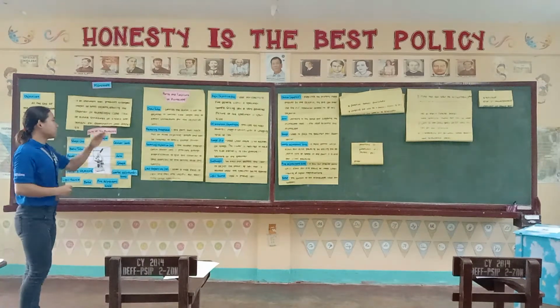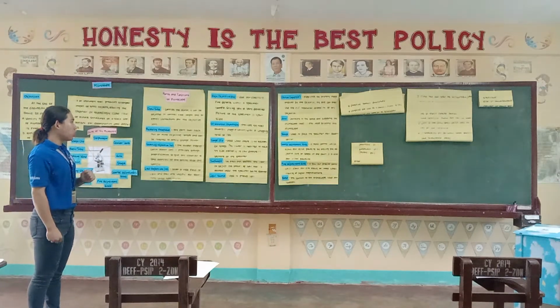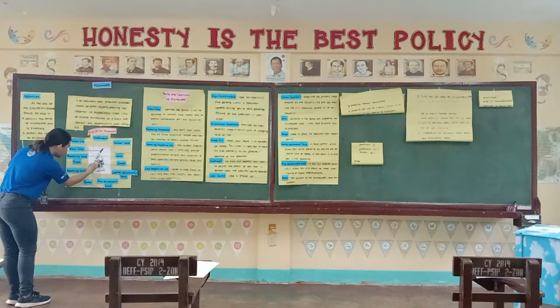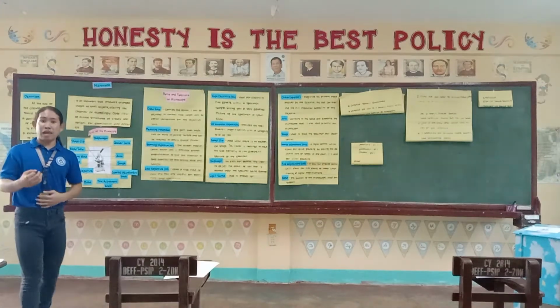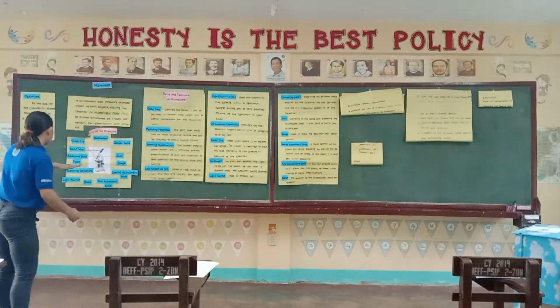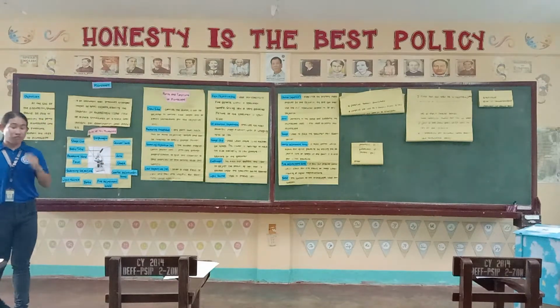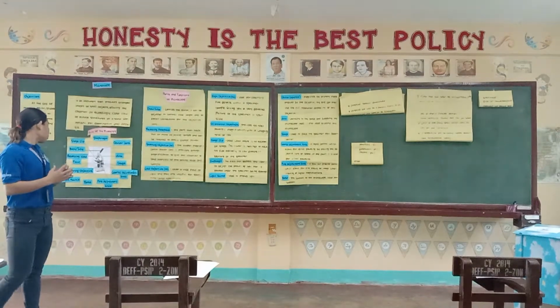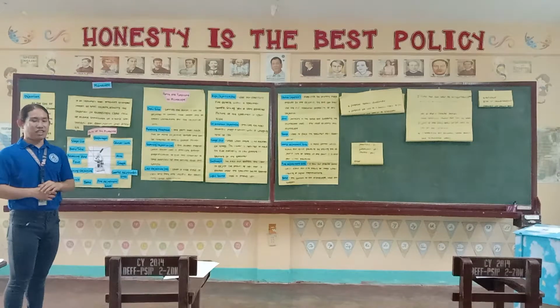So the stage. The stage is used to place the specimen for observation. So over here, this one is the stage. Kumbaga, ang specimen or ang structure na imong i-observe is dili siya imong ibutang. Be able ang mga lenses o ang different type of objectives makita nimo dayon. So it holds the specimen, ang ato ang stage.